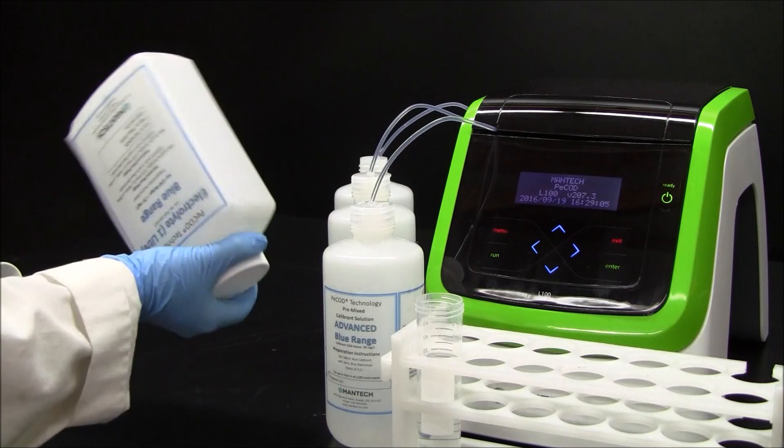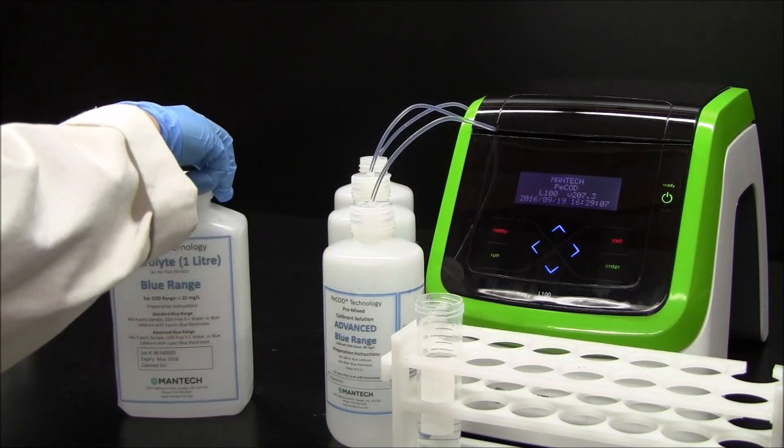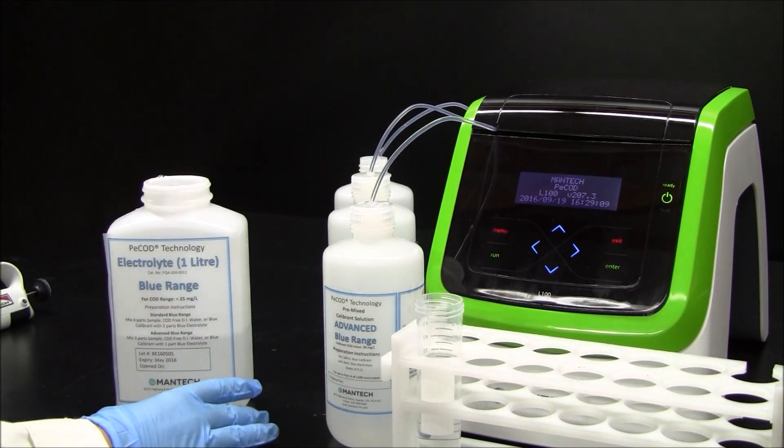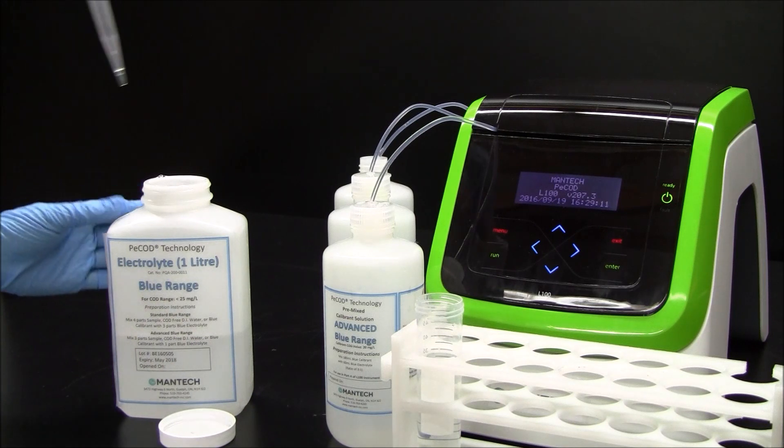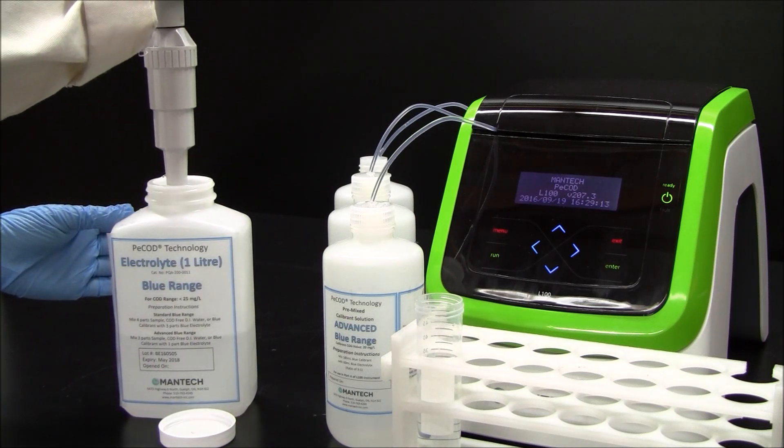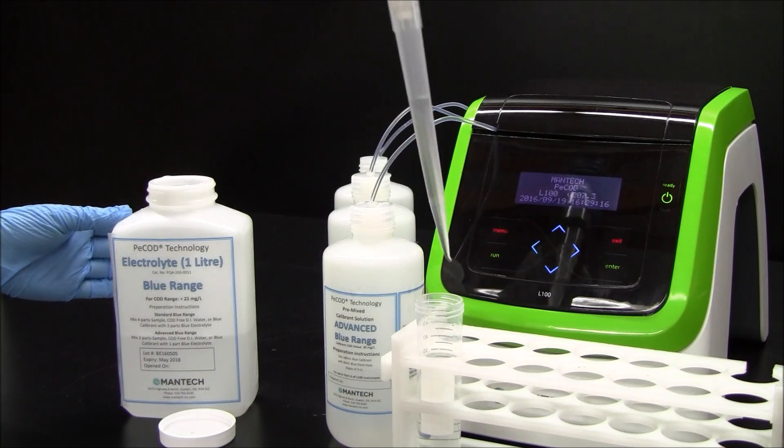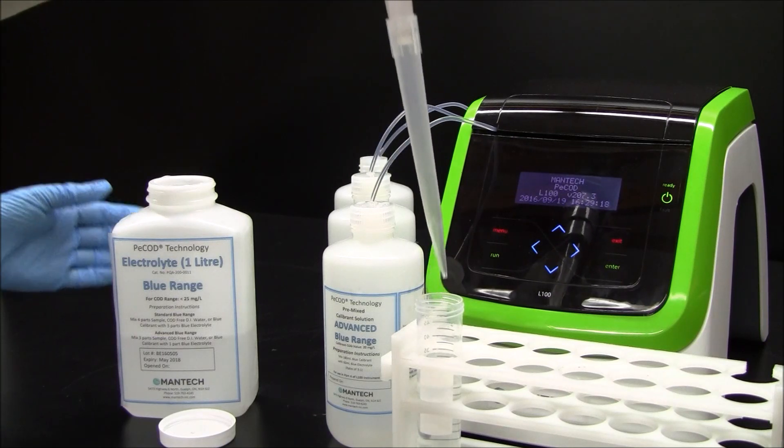Mix the electrolyte solution as specified in the quick start guide. Use an auto-pipet to measure the electrolyte and sample in the prescribed ratio. Remember to use a new pipet tip for each sample.